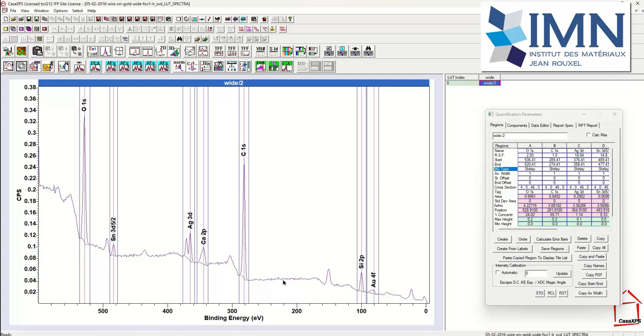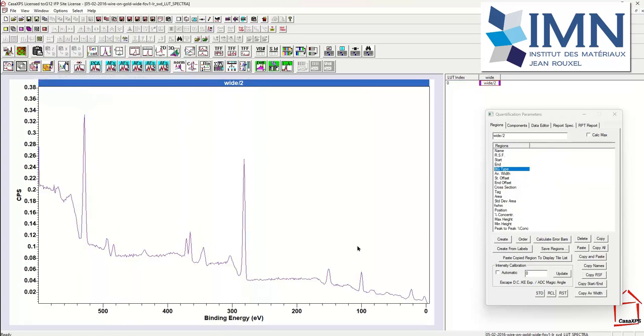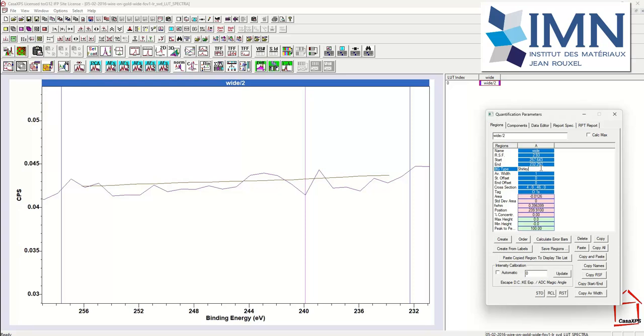So the first thing that one ought to make sure is that these data really are conforming to Poisson statistics, because that will be the assumption by which these uncertainties are calculated. So let's now go back to the raw data without any regions, and let's see if we can estimate the uncertainty, and that will be based on performing a regression calculation, that is a linear calculation of a background that goes through the data.